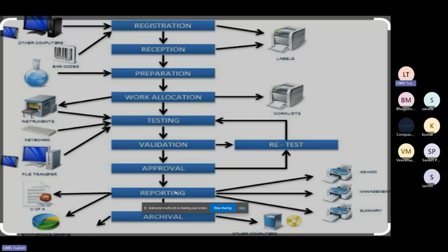The archival should be such that it is not tampered with, and it should be in control also. Some limited persons should have access to it. And also it should be reproducible. It should not happen that the hard disk is damaged with that particular system.